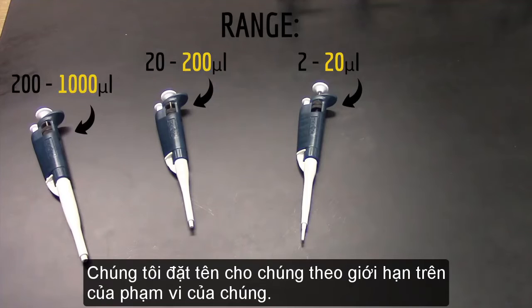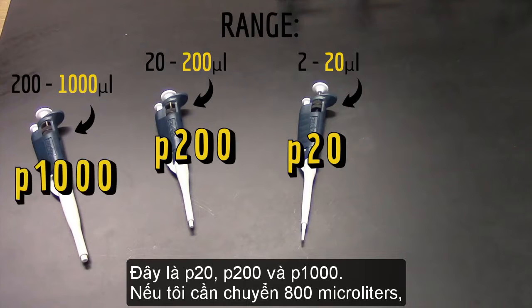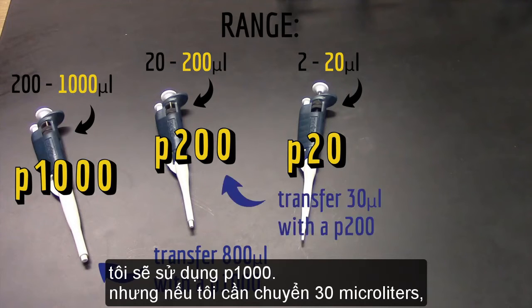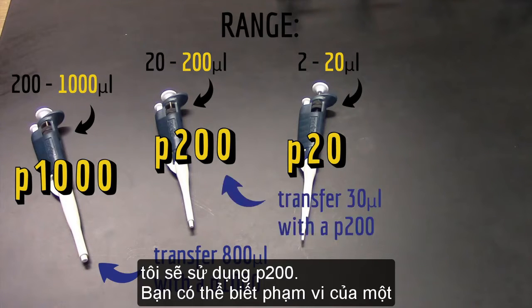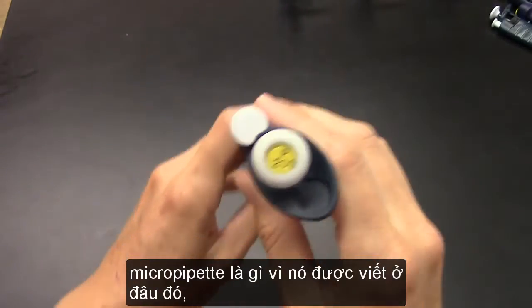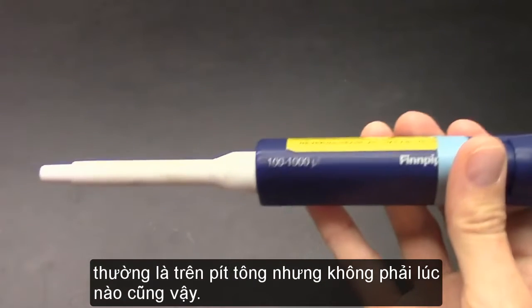We name them according to their range's upper limit. This is a P20, a P200, and a P1000. If I need to transfer 800 microliters, I'll use a P1000, but if I need to transfer 30 microliters, I'll use a P200. You can tell what the range of a micropipette is because it's written on it somewhere, usually on the plunger, but not always.